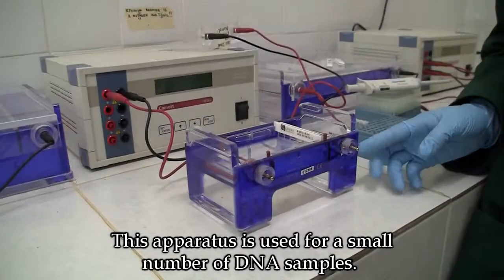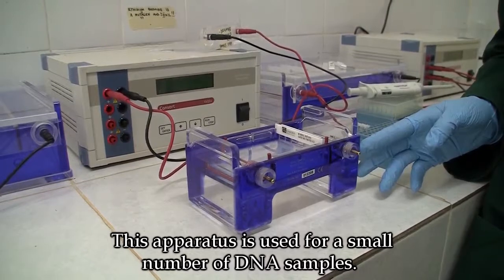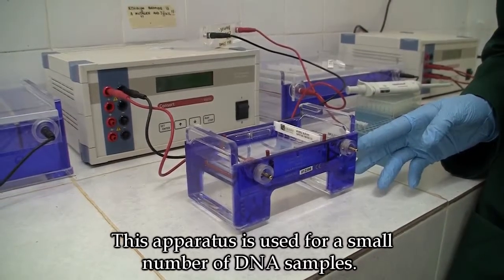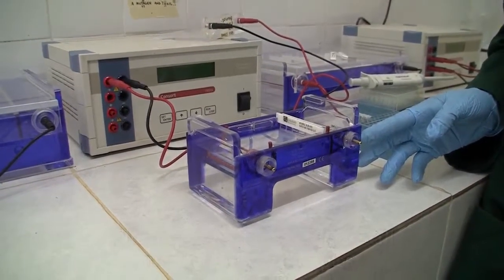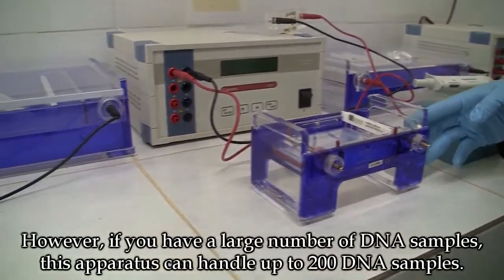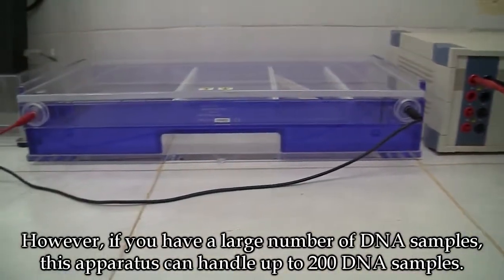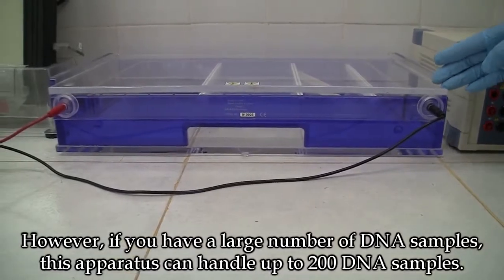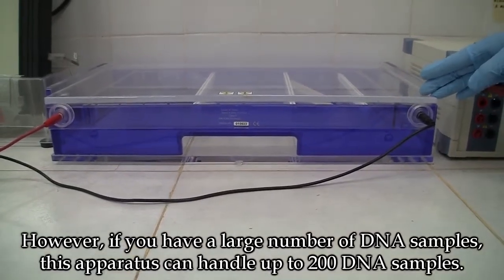This small apparatus is used for a small number of DNA samples. However, if you have a large number of DNA samples, these apparatus can handle up to 200 samples.